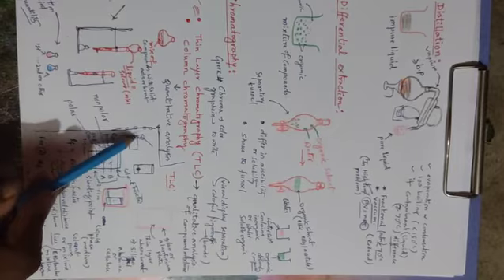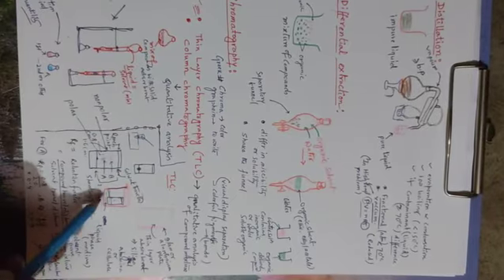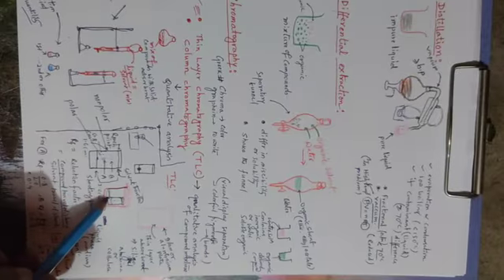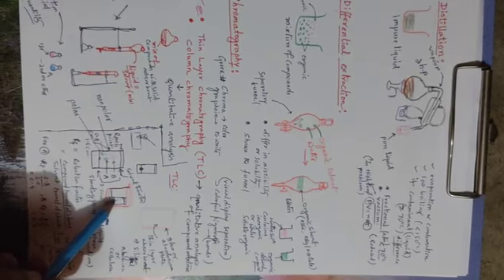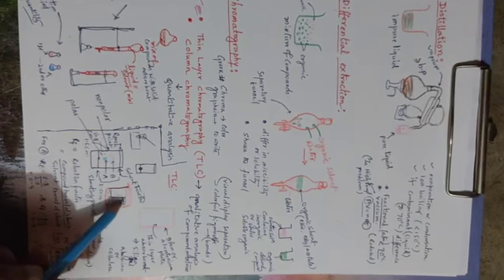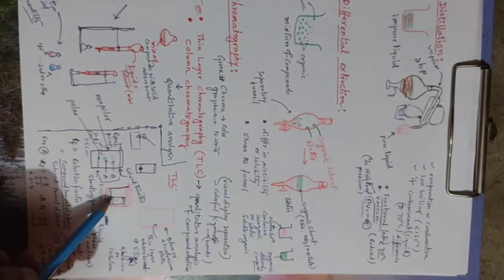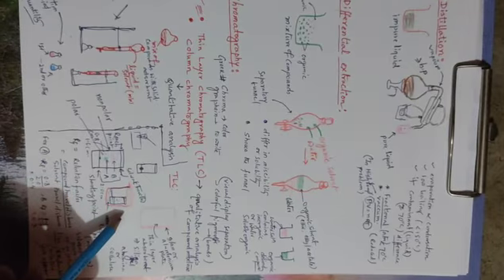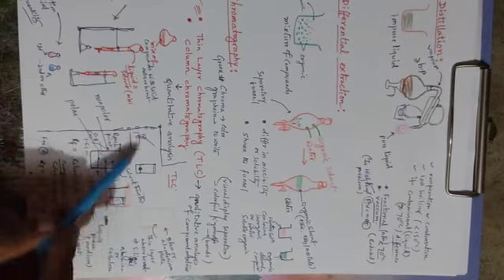We don't know how many spots there are, but because the compounds differ in distribution, the spots get separated here. So qualitatively we can see how many spots there are, and then we can see the number of compounds in the mixture.